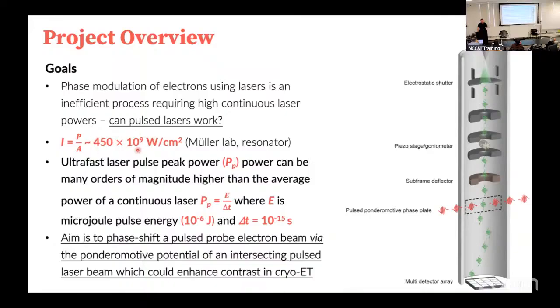I had spent time as a postdoc working on a kind of next generation electron microscope where you really don't have an electron source that is continuous. So that beautiful beam that you see downstairs, whenever you're on the Krios doing alignments, that beautiful beam that doesn't even have really fringes at the edge, is a continuous beam.